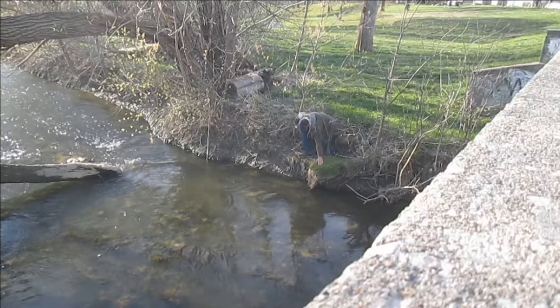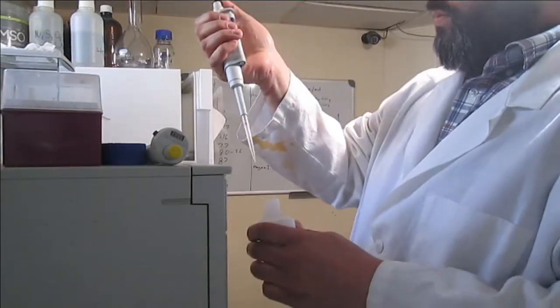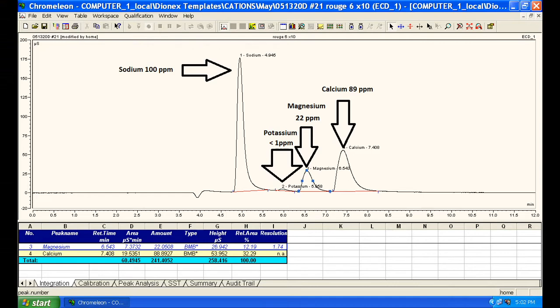My river sample was run at 1:10 dilution, which gave me a way to verify the calibration on my pipettes. Sodium is everywhere, so no surprise here. Calcium is also very abundant, but there's also a bit of magnesium and potassium.